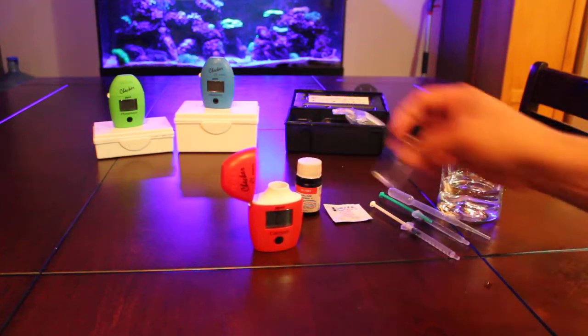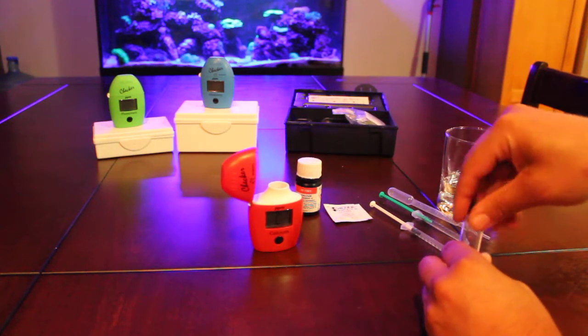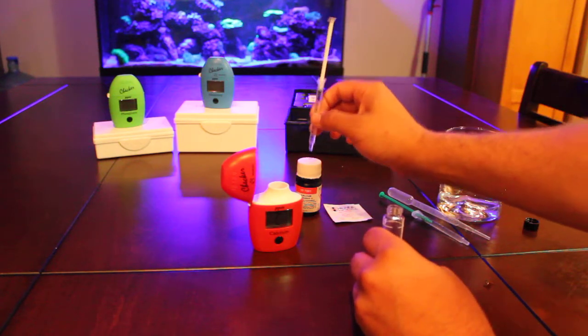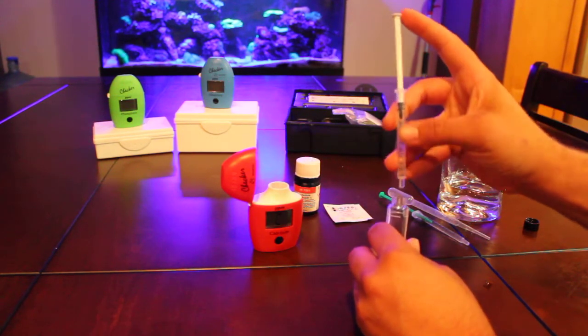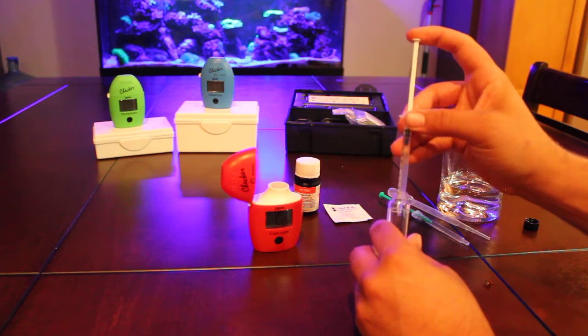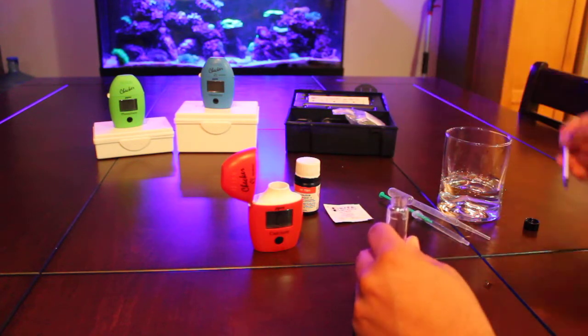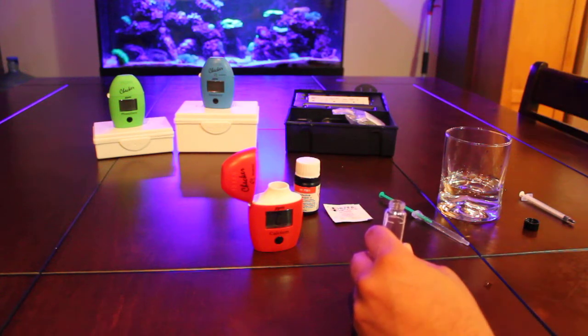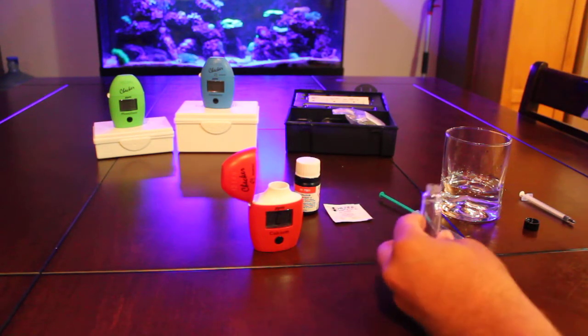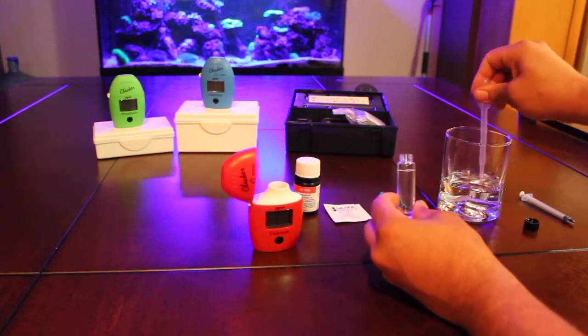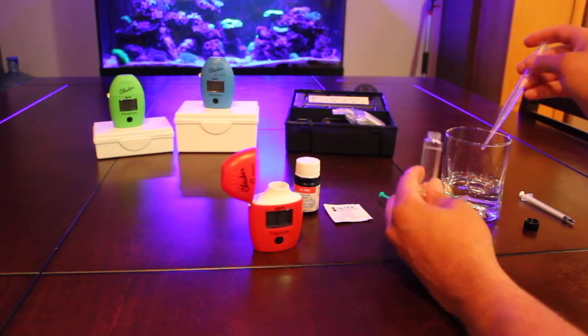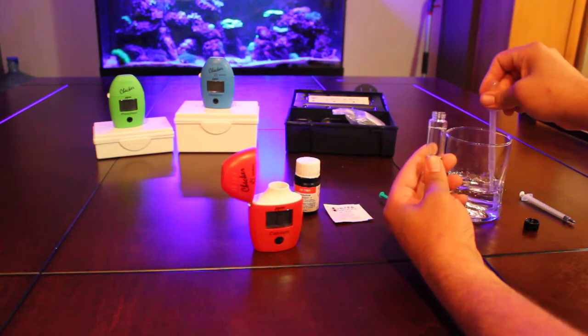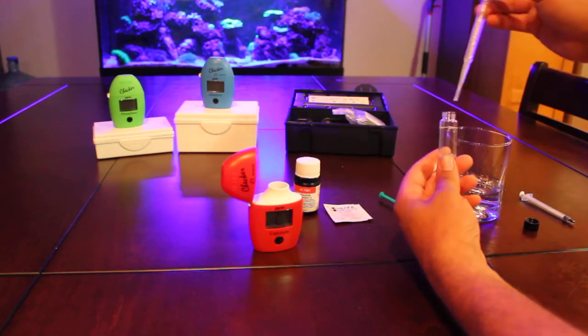Okay, so time to add number one. All you're doing is using one mil of reagent A. I've already taken it out to kind of speed this up a bit. Put that all in there, and then you're using RODI water from your system, just plain RODI water, no salt, no nothing. And you want to fill it up to the 10 mil mark with RODI water and the reagent A.